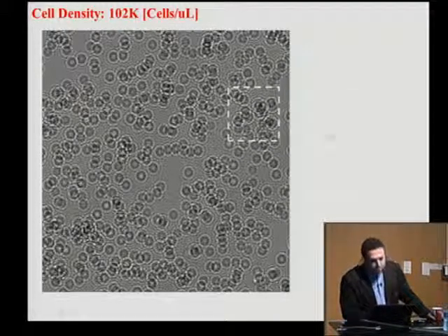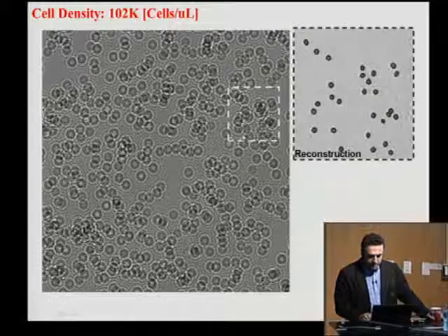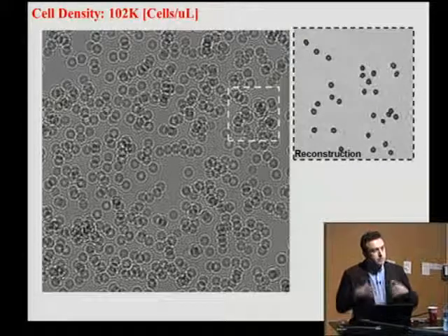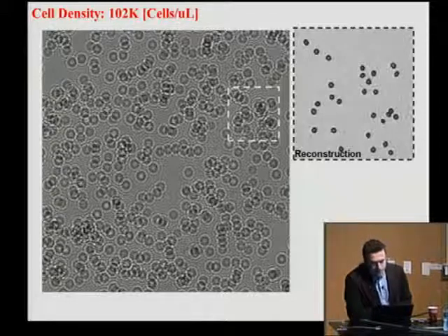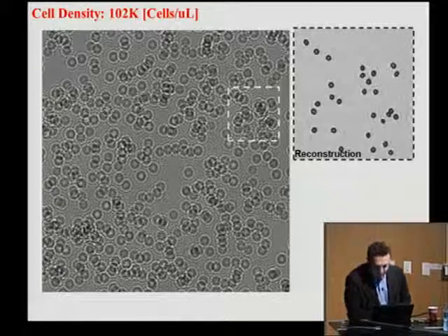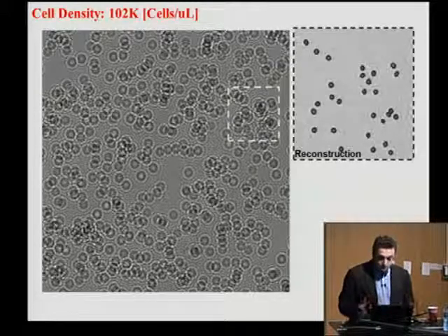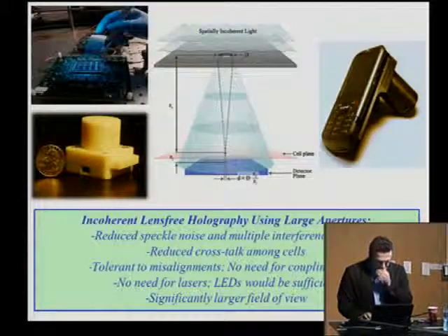So essentially, you can take fields of view like this, where there's a crowded region here. Many cells start to talk to each other in a shadow domain, but you can start to reconstruct them to reveal or to backpropagate the optical field after some phase recovery, which I'll describe in the next few slides, to go back to the plane of interest. And you can do this across a very large depth of field. You can focus back to a millimeter, half a millimeter, 2 millimeters, depending on your object. Nicely matching to a conventional microscope objective.